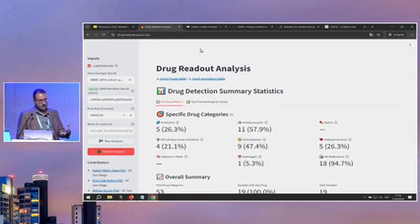But if you want to check anything in particular, you have basically two options. One is to use the libraries directly on the GNPS job, and then you can check directly on the tool itself. I can show you later, but I don't have it right now. Basically, you can just open up your job and look at the annotation list, which is a standard feature for any GNPS job, and check on the library how the cosine is for your spectra.